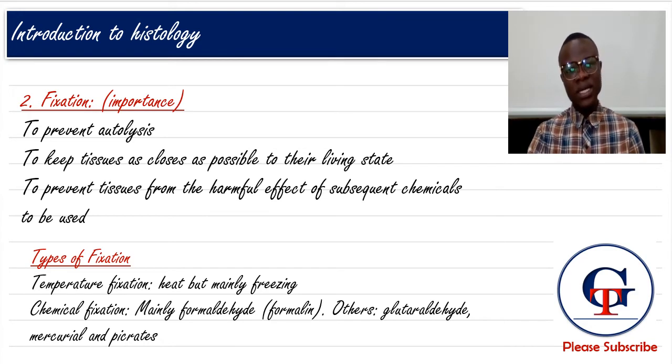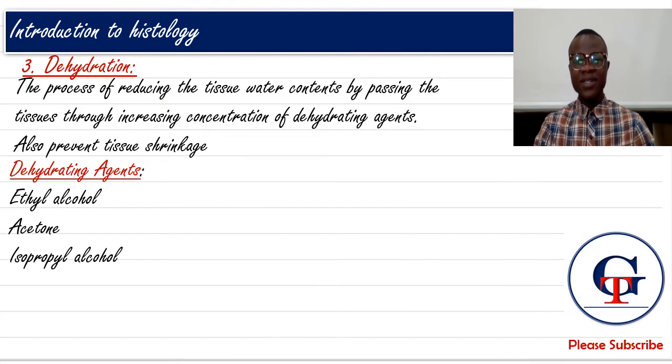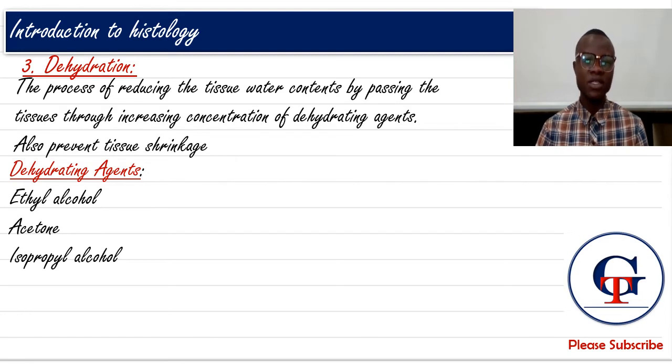Next, we will look at the next step that is involved in this process. So let's move on. Next is dehydration. As the name suggests, this process involves the reduction in the tissue's water content. Our aim is to, of course, preserve our tissue and maintain the living state as closely as possible.